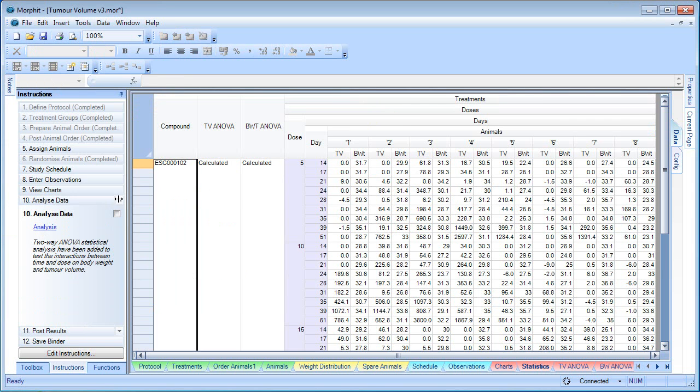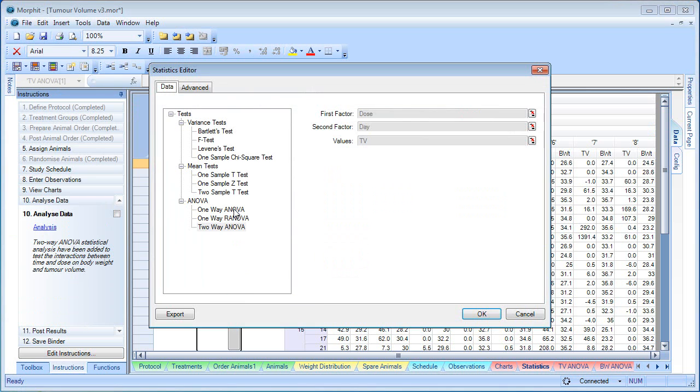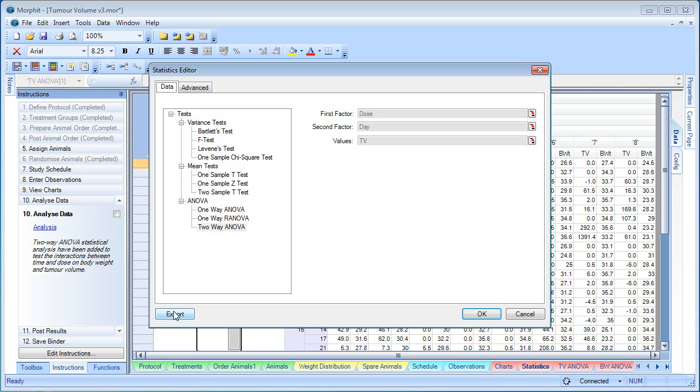We can take that data, and we're going to run a two-way ANOVA over the data. This is looking at the tumour volume against the factors of dose and day. And we can create a snapshot of that analysis in the new sheet.